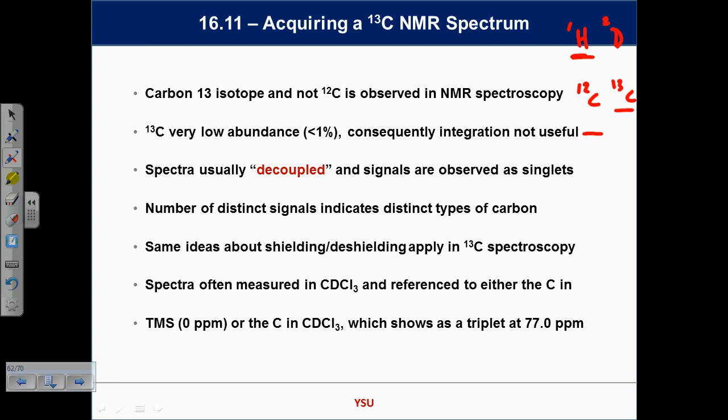So if you do spectra in the future, you'll do a proton in about 5 minutes. A C13 spectrum could take you overnight or a week. For a biological sample, if you don't have much of it, maybe a month. Right? These are very, very long experiments. So it is the same technique.